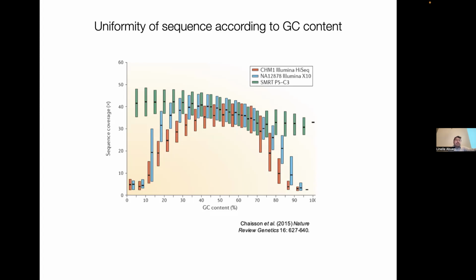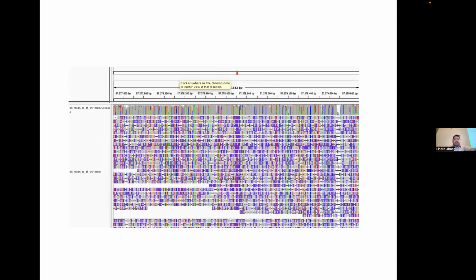The problem of PacBio is that you have no amplification of the template. That means you're sequencing 1 molecule at a time, which means that you see every error made by the polymerase, but also errors with the visualization, with capturing the information. So it's not buffered by a cluster like in Illumina or a colony. So this is what PacBio raw data looks like. So it's very nasty, right? So you can see here, all the lines in purple are indels.